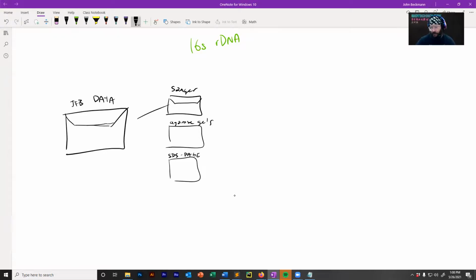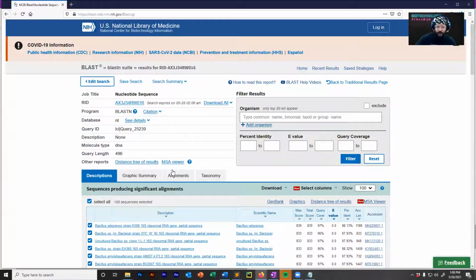One of those folders is going to be your Sanger data. Within this, you're going to have subfolders of either date or experiment that you're working on. Within those is where you would save these particular important data files. So that's just proper organization of these data.